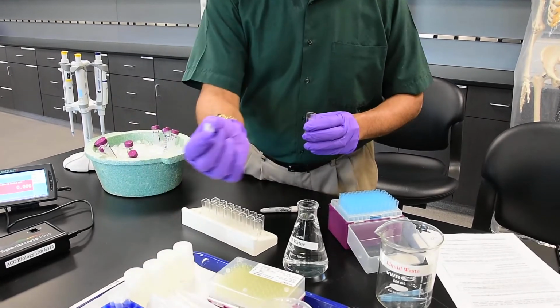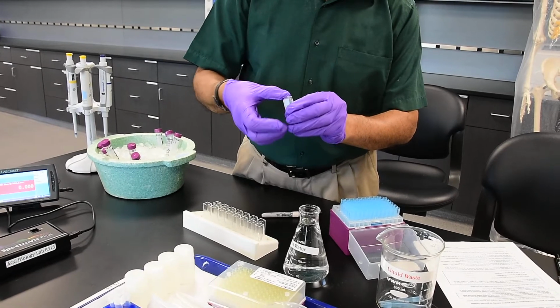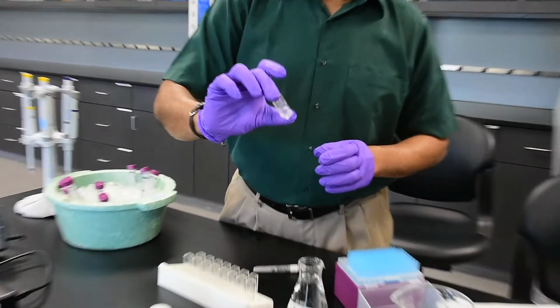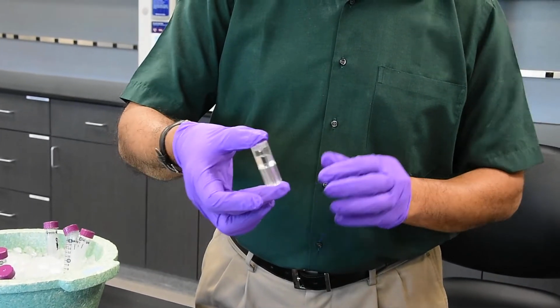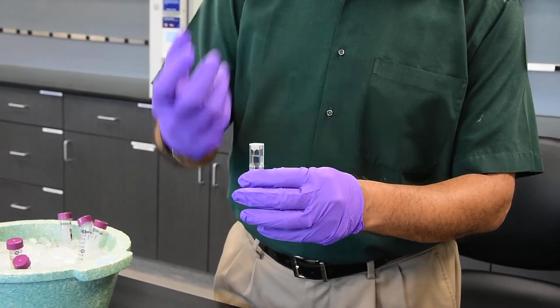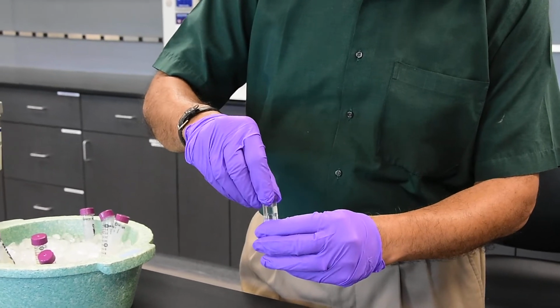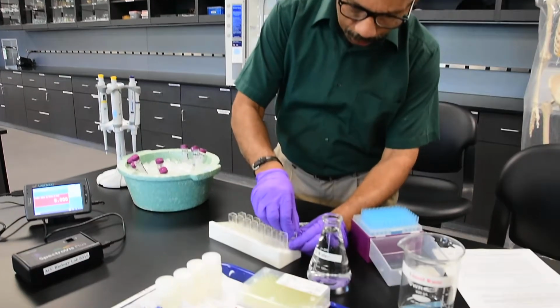There are little small closures that you can put on these cuvettes, and these closures will help you do this dilution by mixing this. And there are other ways of mixing this also, by pipetting in and out, or if you're using a test tube, you can use a vortex machine to mix this. Now I have the first dilution done.